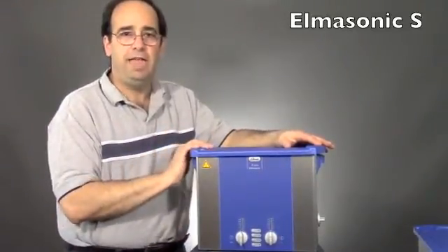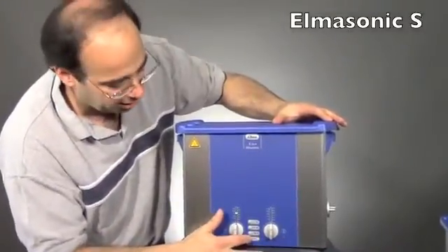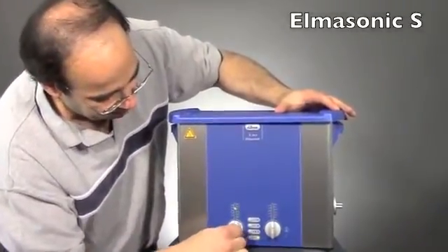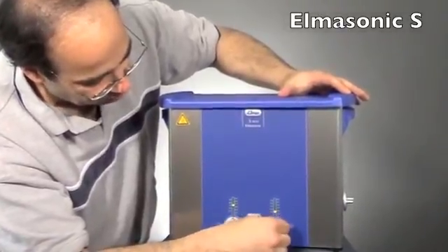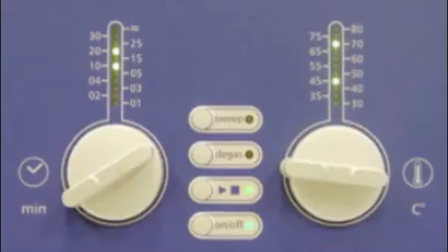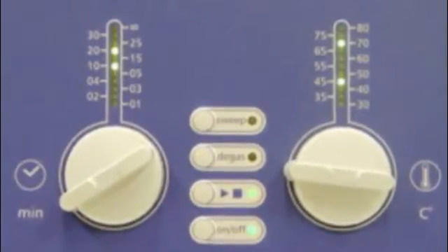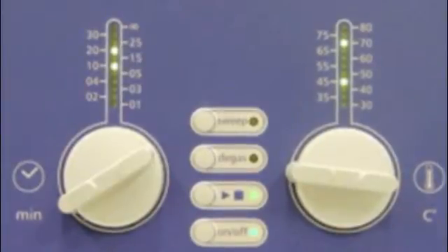The other thing about the S line is that it's got these nice LEDs. All you have to do is turn it on, set the minutes here, set the temperature on this one, and this will show you the set time and the actual time, and the set temp and the actual temp. That way you'll be able to constantly monitor your process.